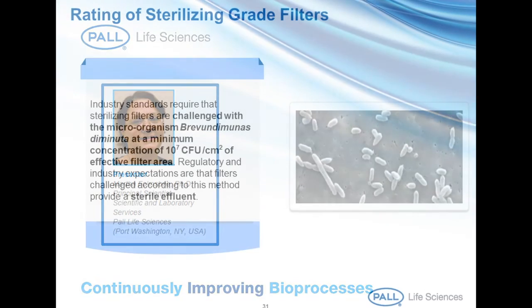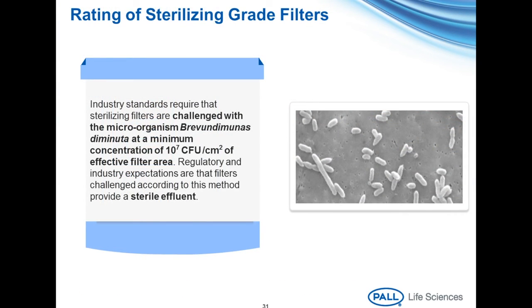So both sterilizing filter rating tests and most of the process-specific tests are usually performed with Brevundimonas diminuta, and this is as specified in the ASTM standard, so it's an industry standard, not just something we do here at Pall. It's the standard test method for determining bacterial retention ratings of membrane filters utilizing liquid filtration. So B. diminuta is the bacterium used, often called B-dim.